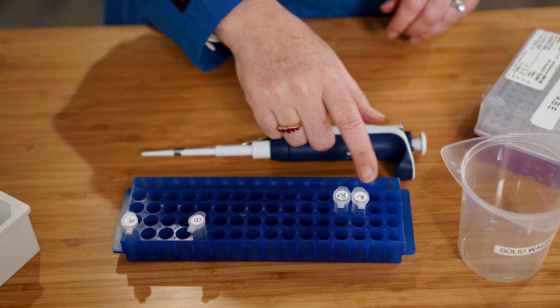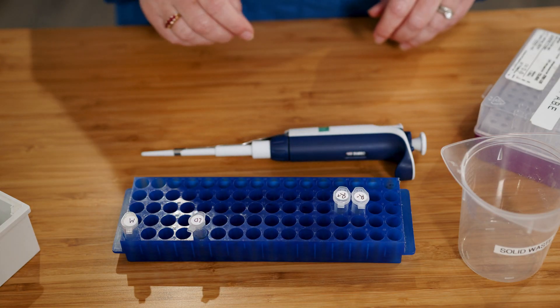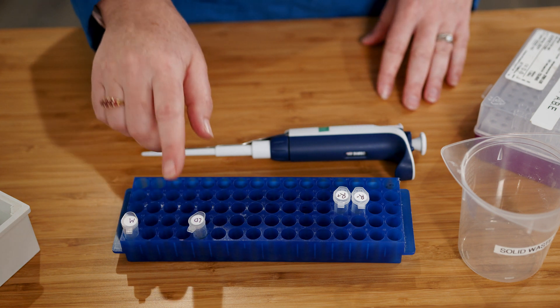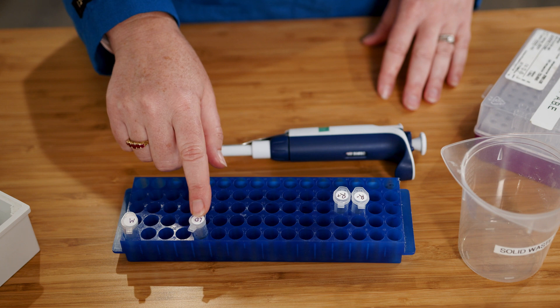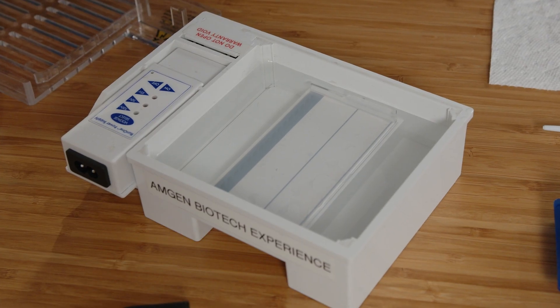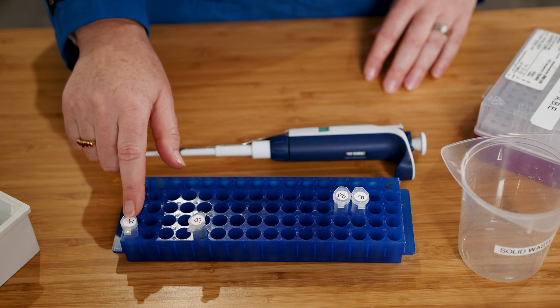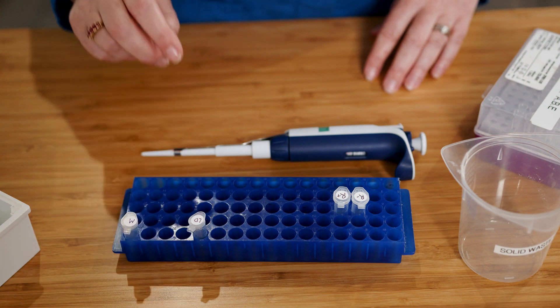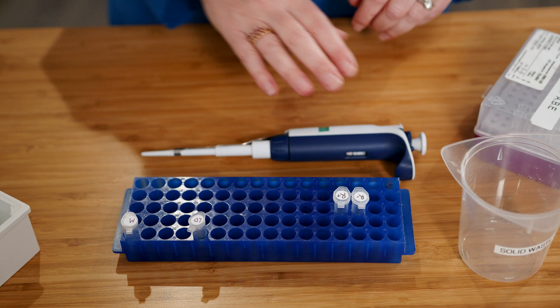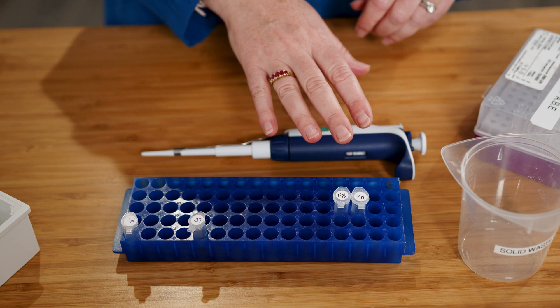These are the experimental and the control samples from the digest in our last lab, lab 2a. Because these samples are clear, I'm going to add loading dye to each tube so that I can load them into separate wells in the gel. I'll load DNA ladder into another well. The DNA ladder contains samples of DNA fragments of known sizes that we can compare to fragments from our experimental and control tubes.